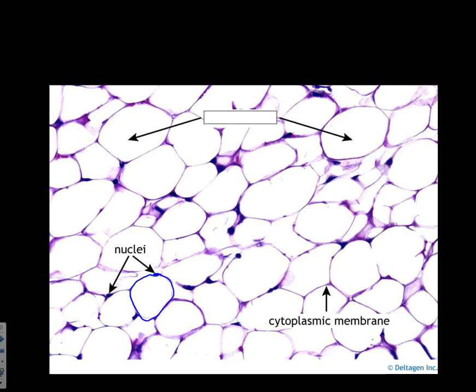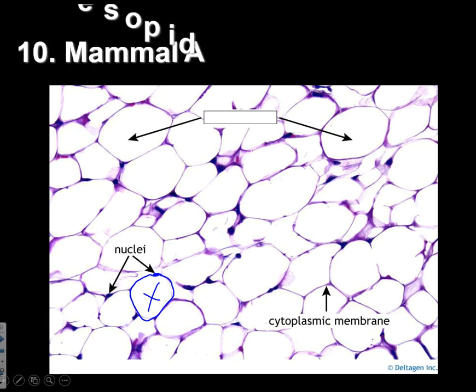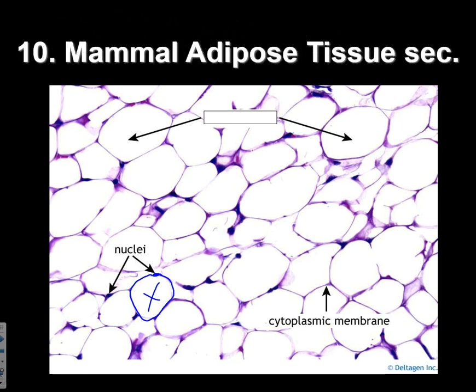And then we got the nucleus up here, and this whole middle part looks empty. It's not. It's full of fats and oils. This is adipose tissue. Okay, it looks like a bunch of engagement rings, right? Now you may or may not see the nucleus in every single one of these, like that one there you didn't. But this one here you do. Here's the nucleus, and there's the cell. Big, what looks like empty space in the middle, but is actually oil, nice and clear. That is adipose or fat.